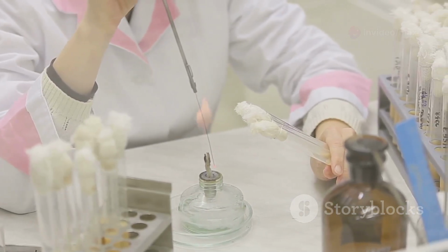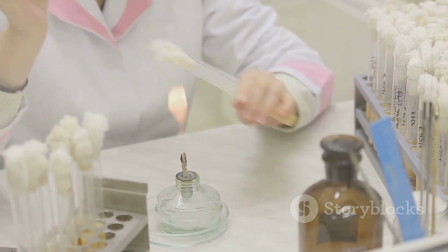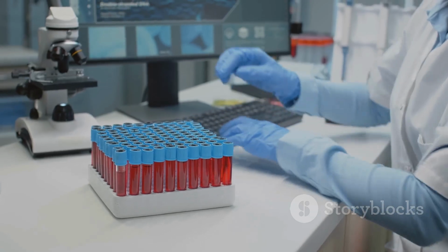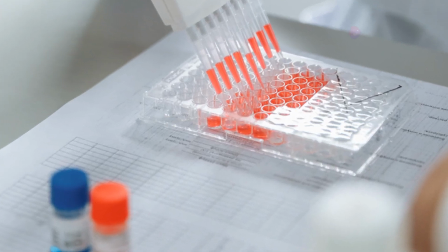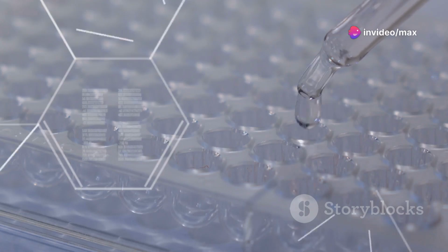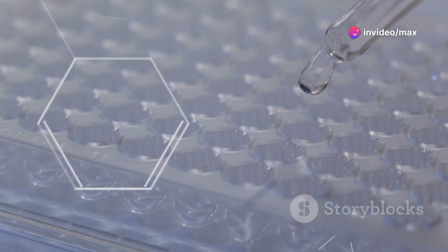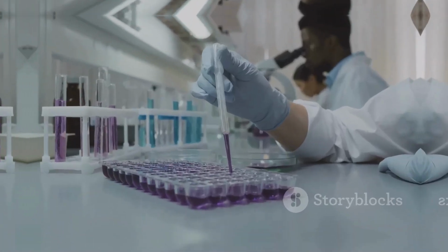Prepare to be amazed by the sandwich ELISA, known for its specificity and sensitivity. Imagine building a sandwich with antibodies and antigens. We use two antibodies recognizing different parts of the antigen. The capture antibody coats the surface, ready to snag the antigen. The antigen binds to the capture antibody, like the first slice of bread. The detection antibody sandwiches the antigen, ensuring specificity.